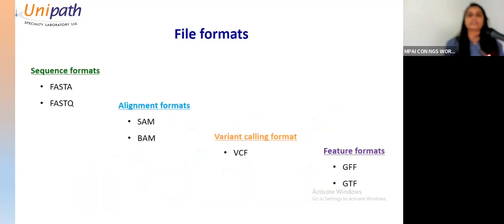Now, to understand the basics of all the tools, it's very important to understand the formats. It's like we all being very different persons, we understand a certain type of thing. We are able to speak a certain type of language. That type of limitation is also there with the tools. They understand different types of formats. They have certain limitations, or you can say they are more focused on a certain part. That's why they have a certain format which they are able to understand. So these are all the formats which are taken by one tool or another to give you meaningful variant interpretation.